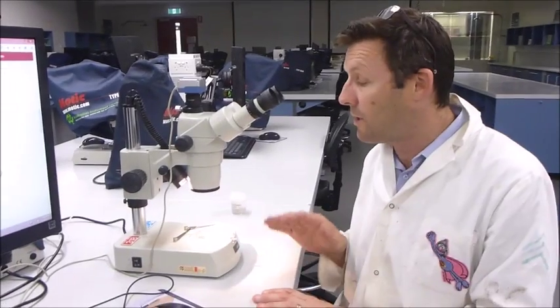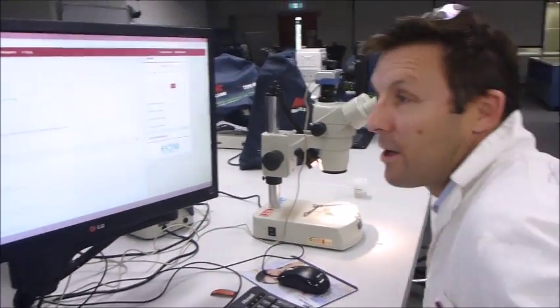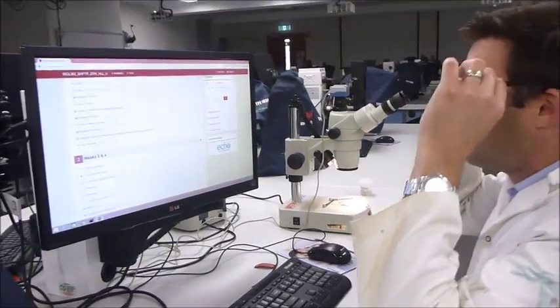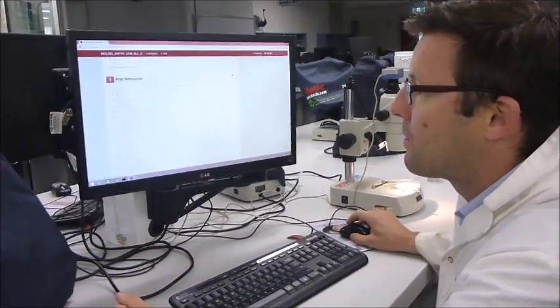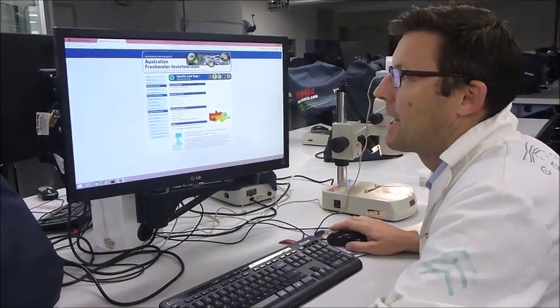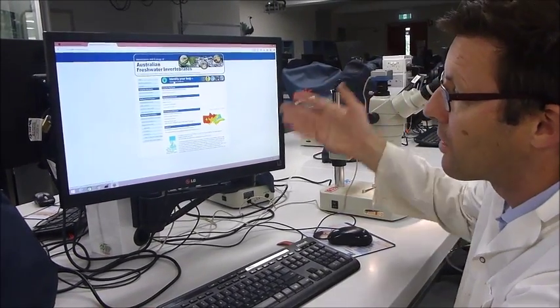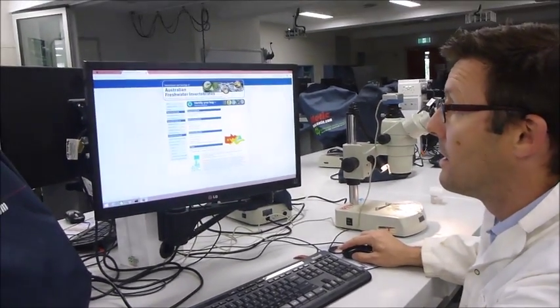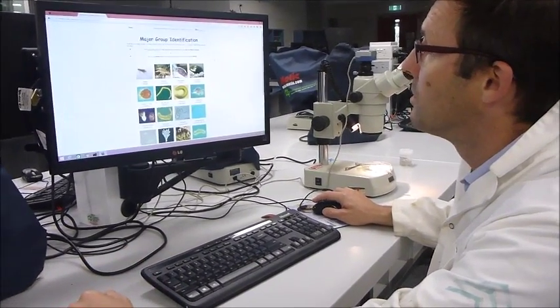So you can use the water bug book, and there are copies available in the lab today, or there is another useful resource, a bunch of useful resources on iLearn. Under Prac Resources, particularly useful is the Freshwater Bug Key by the Murray-Darling Freshwater Research Centre. This is it here, and you can work through this, identify your bug, and it will take you through steps to identify each of your critters.